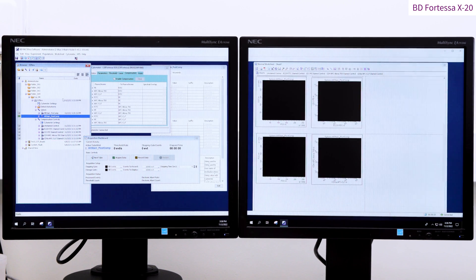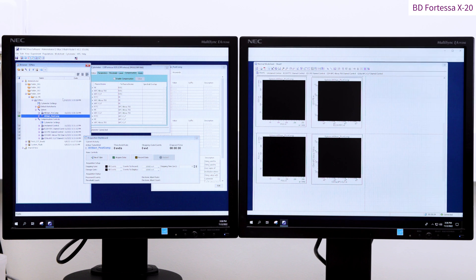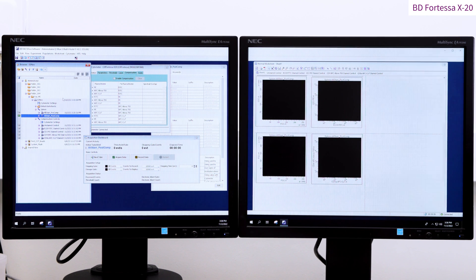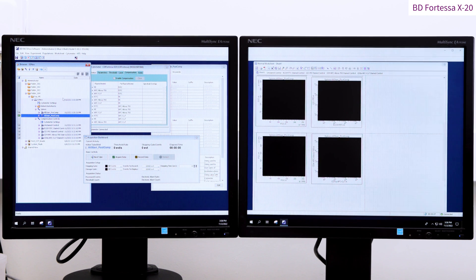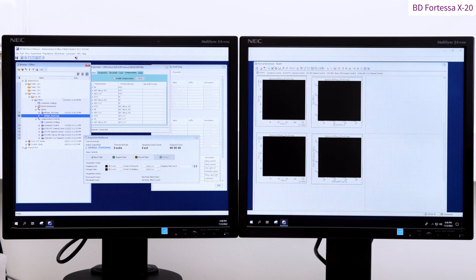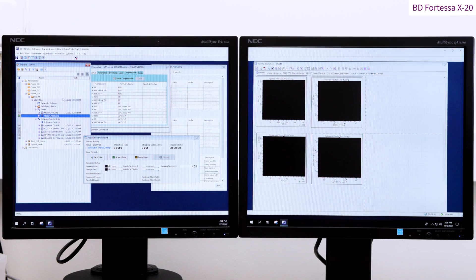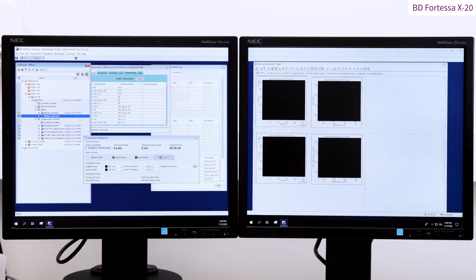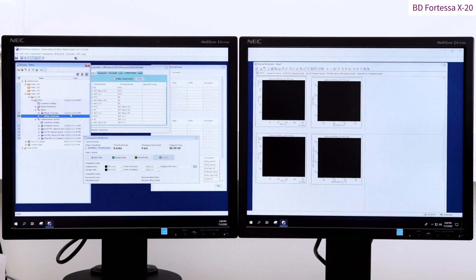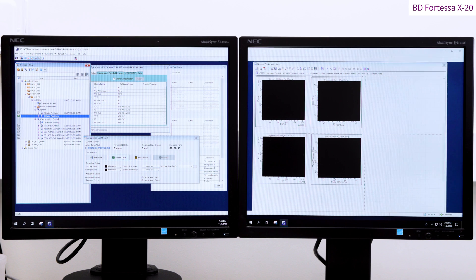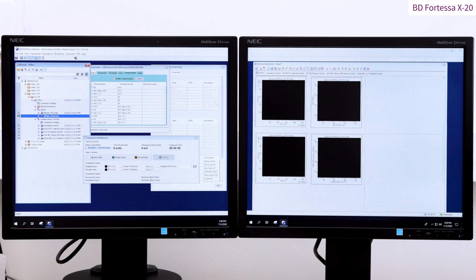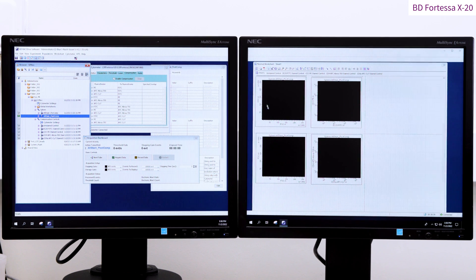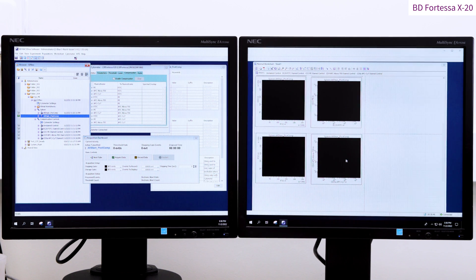The applied compensation values won't be seen in the cytometer settings compensation tab. You won't get any compensation from the samples you acquired before calculating the compensation matrix either. However, any newly created tube will be associated with the new compensation matrix applied.